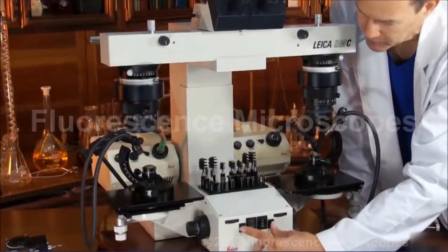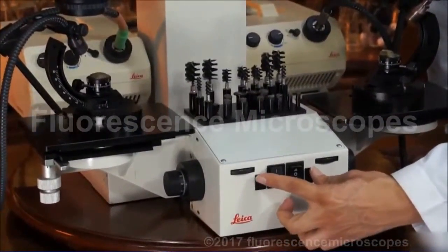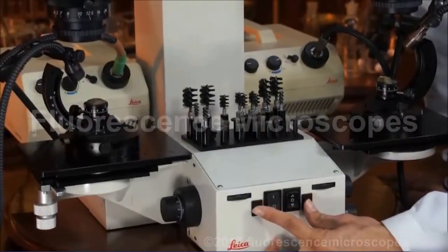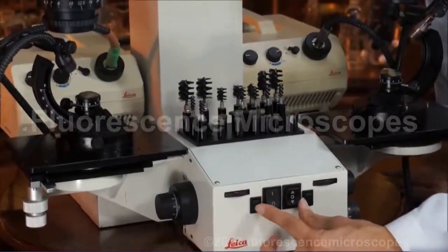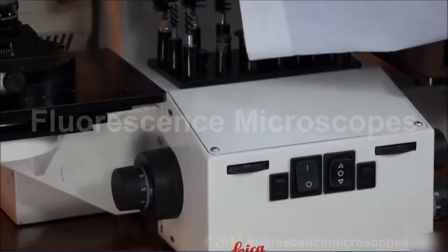These knobs are for optional halogen lights. There's a 6 volt, 20 watt adapter on the back for each side, with on/off switches and variable intensity. We're not using it with this configuration because we've got the 150 watt fiber optic system.